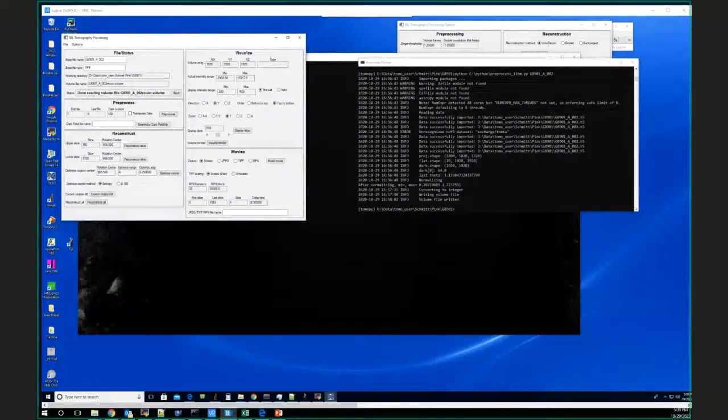One of the things is that you can collect an awful lot of data, as you just saw, with a CT machine, synchrotron or lab CT machine. And the speed at which we can collect it and even reconstruct it, the reconstruction was slower than the collection, but not a lot slower. But the analysis is way, way slower, and it lags behind the collection and the reconstruction by orders of magnitude. That's where it's a computer science problem.